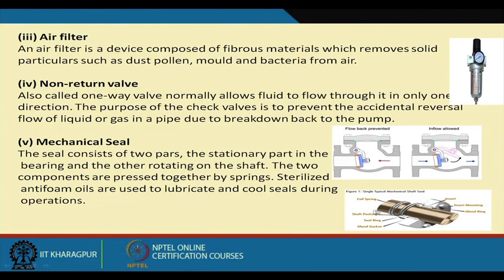If we lubricate the shaft, the frictional force will be reduced, and then the heat generation will also be reduced to a great extent. So this is how the mechanical seal looks. You can see the different types of packing materials the industry puts inside, and only a few companies in the world can produce this kind of mechanical seal for the fermentation industries.